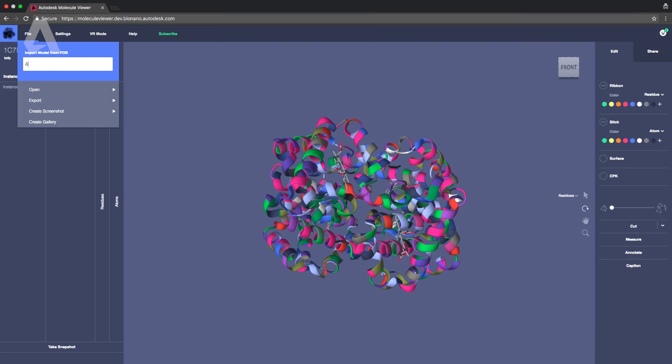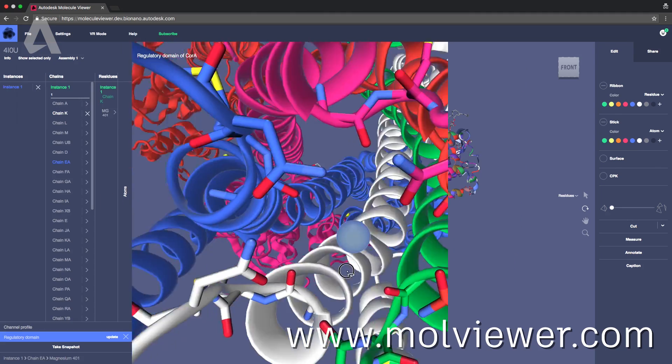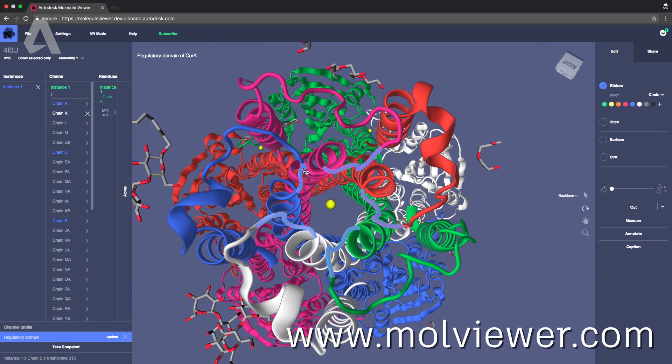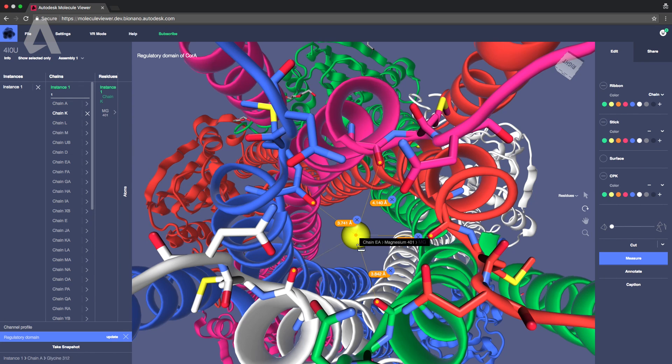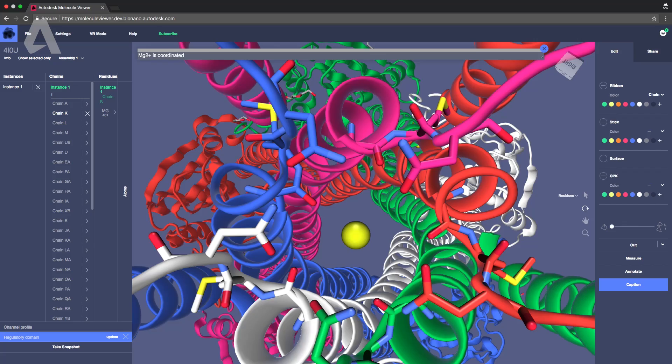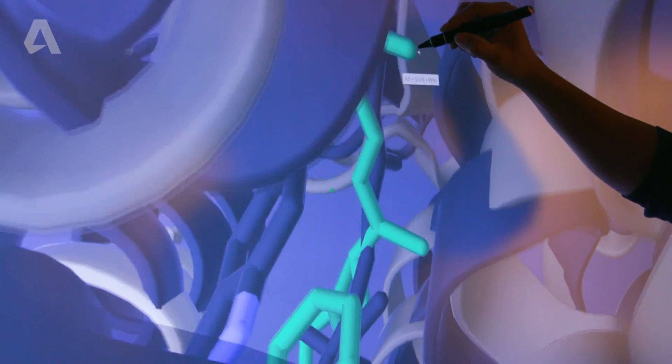Just load in any protein file from the protein data bank and visualize it in 3D. Customize its representation and color. Annotate your points of interest or caption the scene. Save snapshots of any state and share all of this content by generating a web link.